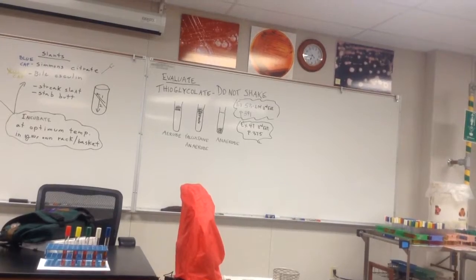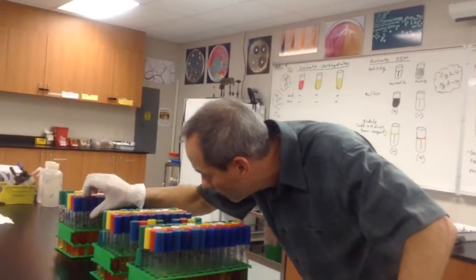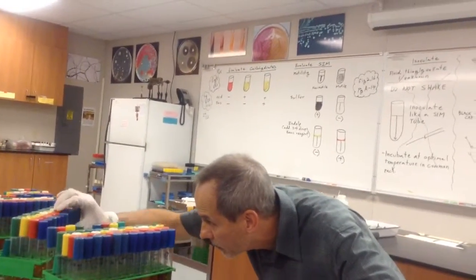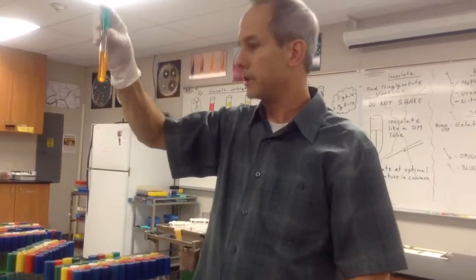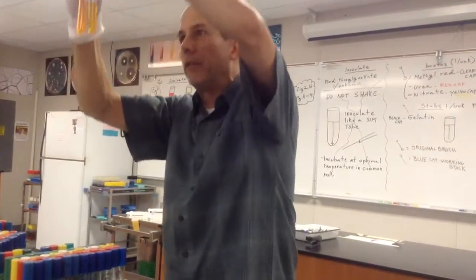So don't you dare come up to me and ask me, is this red or is this yellow? We know it's orange. I think it looks yellow to me. I'm going to find a more orangish one. Mine are pretty orange. Well, I'll stick with that one. That looks orangish. It's orange, right? It's definitely not. Let me find the perfect yellow one. It's definitely not that yellow.